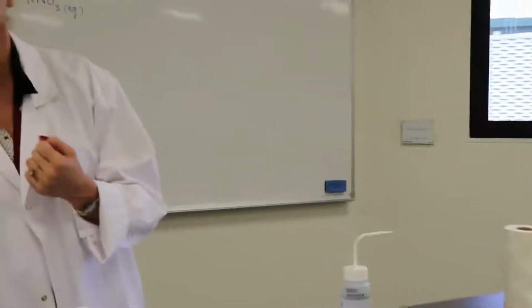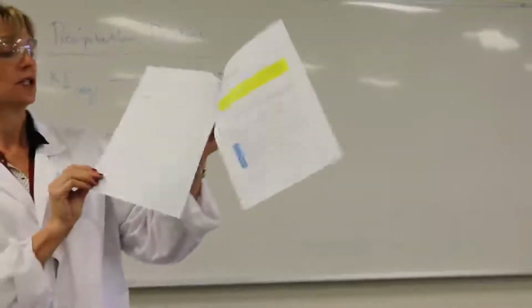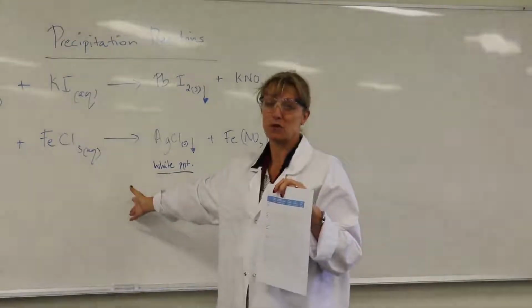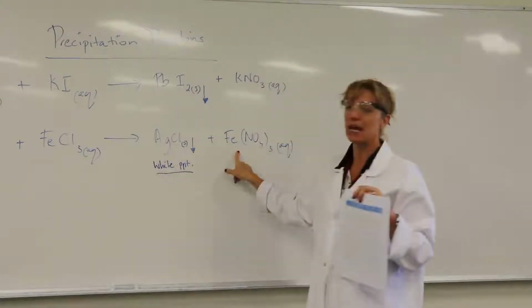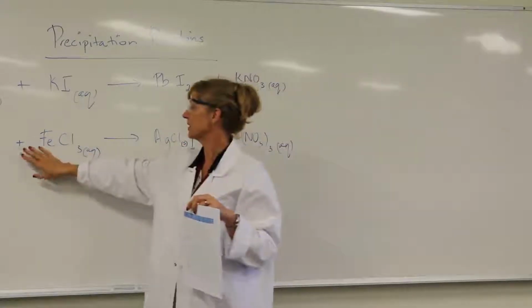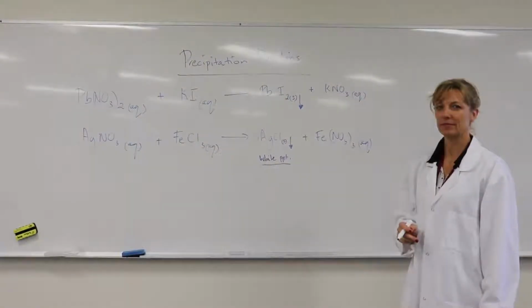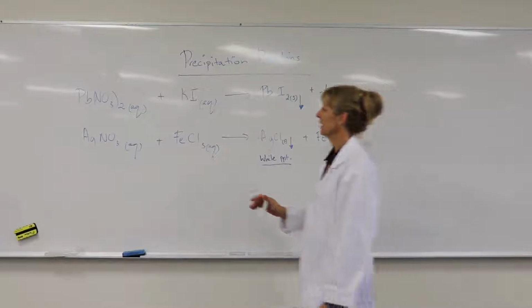Any questions? So once you've done the whole table, there's questions to answer. These questions here, but also for every precipitate that you find, you need to write a balanced chemical equation, and that will be great practice for you. So you need to work out what the precipitate is because you've got a choice of 2, and it won't necessarily be as easy as a nitrate. So you need to check your table. Once you work out what, say you've worked out this one and you don't know which is the precipitate, you go to the table and work it out. And get started.